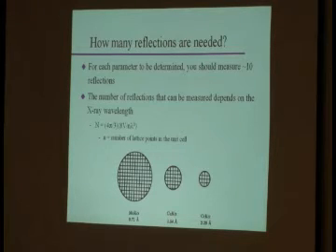There's a limitation on how many of these reflections you can observe with a given experimental setup, because all that you image in reciprocal space is the sphere with a radius of 2 over lambda. That is it. You cannot measure more than that in reciprocal space.